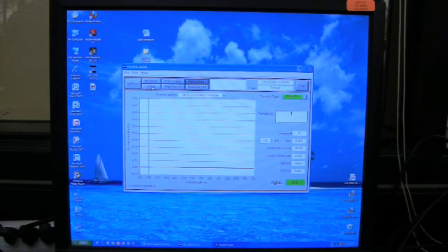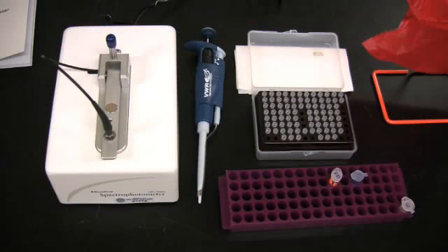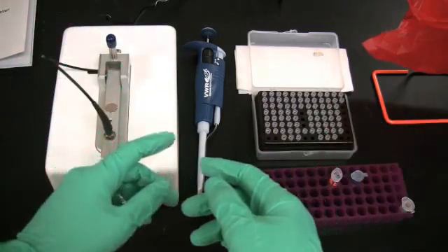After this is completed, you are ready to load and measure your samples. Note that the button in the far left labeled measure is now available. If this button is grayed out and unable to be accessed, you may have to repeat the initialization process. Before loading your samples, ensure that the pedestals are clean. This will afford greater accuracy in the machine's ability to measure your sample.